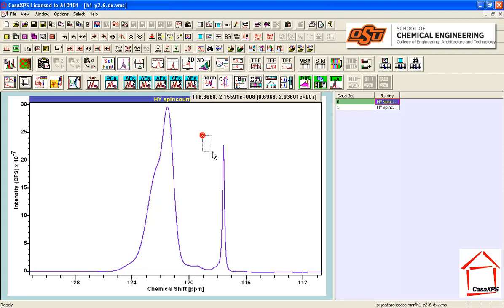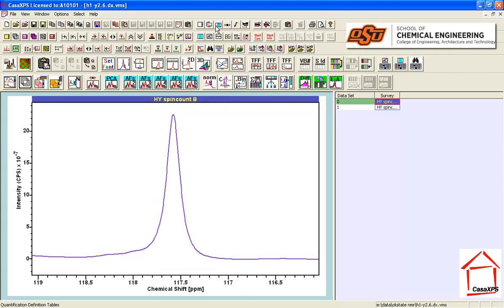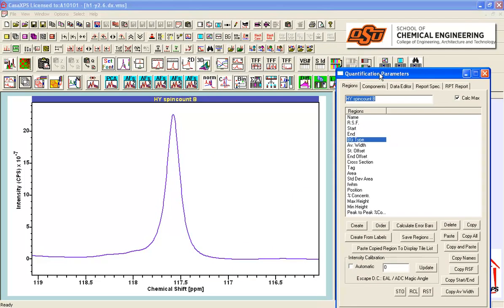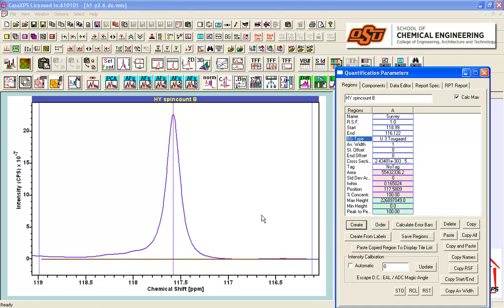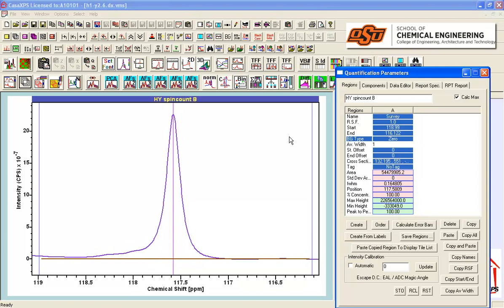If we want to see the chemical shifts relative to some reference peak, for example this one, then this can be achieved by calibrating using the calibration property page on the spectrum processing dialog window. But first we need to identify the peak maximum, and we will do that using a region, and the position of the peak is determined using the CalcMax option, which fits the curve to data bins rather than accepting simply the maximum intensity in a data bin. This interpolation should improve precision of the peak maximum.